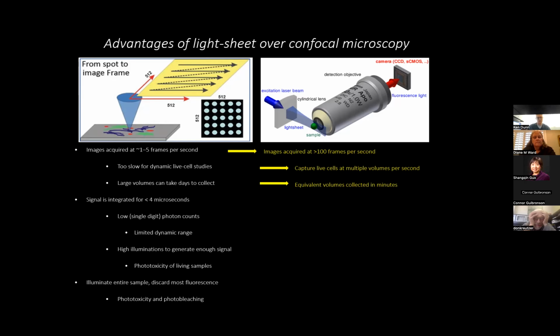And I think this is a really important point, and it's my emphasis here: there's a lot of enthusiasm about large-scale microscopy. The problem is that a lot of times when people show this stuff, they show one image or a couple of images. At the end of the day, it's just not practical for most imaging systems to collect lots of duplicates of 4 different conditions and show them. More often than not, they're just really cool looking one-off images. Light sheet microscopy would be the way that you could actually make large scale microscopy practical.